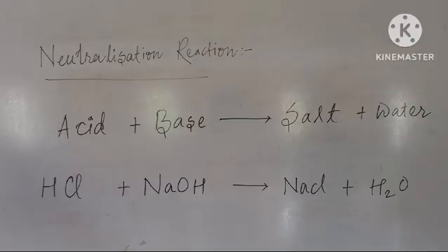Moving to our next activity of the day, neutralization reaction. A reaction in which when we mix acid and base, it gives us salt and water. In this activity we are going to use HCl, hydrochloric acid, in diluted form mixed with water, along with sodium hydroxide in small pellets. It will give dissolved NaCl, which is salt, along with water, that is H2O. And listen very carefully, kids, this particular reaction produces lots of heat.